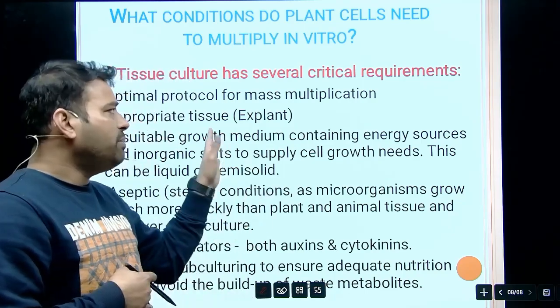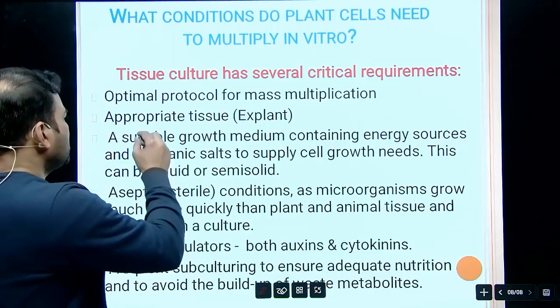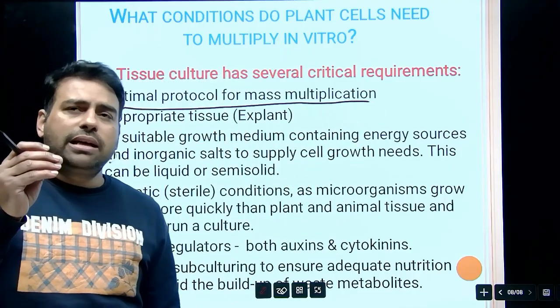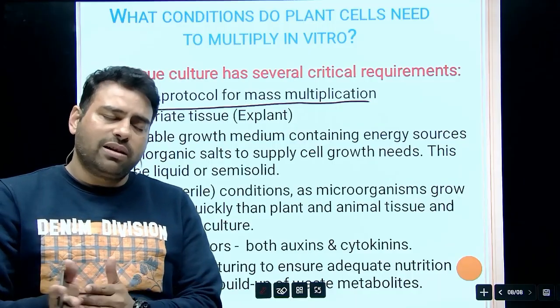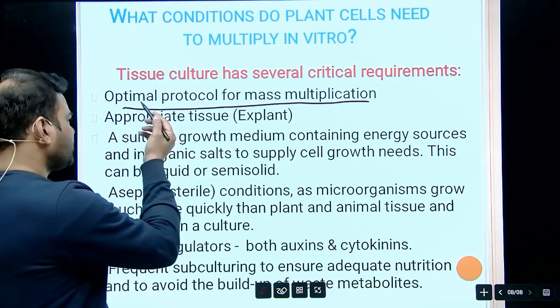Okay, so we will discuss the basic protocol and basic multiplication procedure. So this is the optimum protocol. You can find this protocol in so many research papers, and some videos, some literature are already available on the internet. You can easily find these protocols.